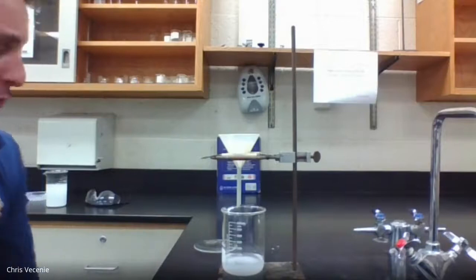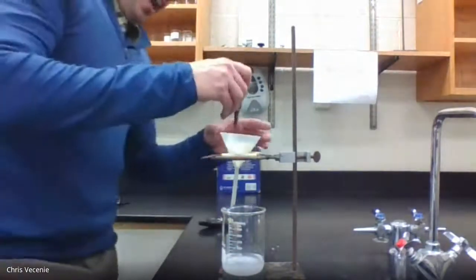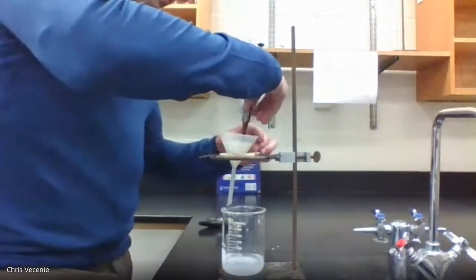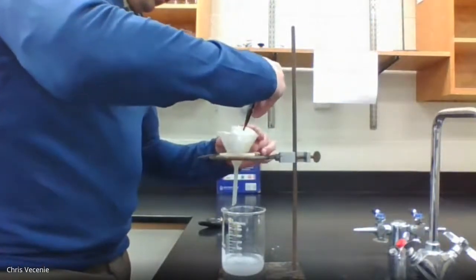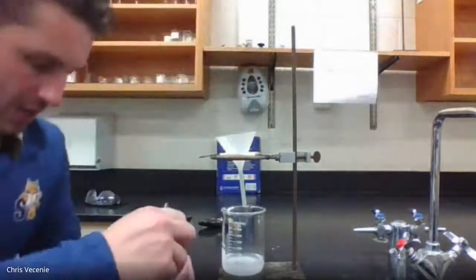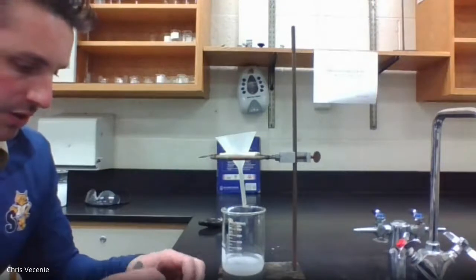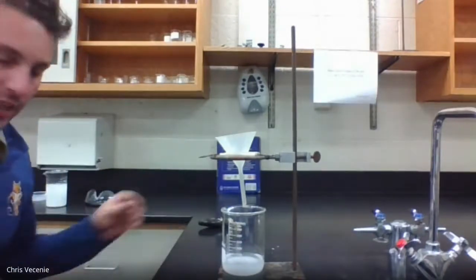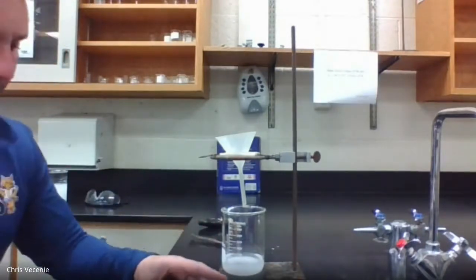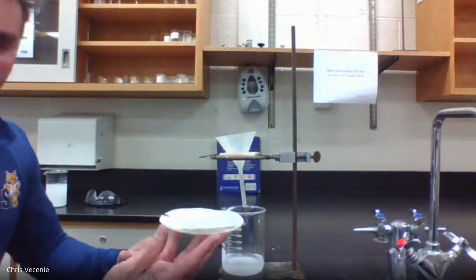Just retrieving these. Taking my filter paper out, I can gently touch it, and I'm going to open it up onto my watch glass. All right, so I opened it up, and you can see I have that on there.